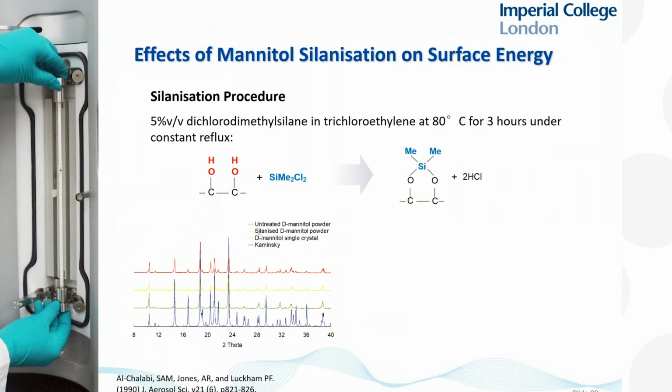Well, I said we also wanted to produce some hydrophobic material. So what we did was we took some silanizing chemical, and basically we went to some trouble to replace all the hydroxyl groups with methyl groups. So we're going to essentially make a hydrophobic material, no hydroxyl groups, so no polar forces, no acid-base forces, just van der Waals forces. And we treated that material. The X-ray diffraction is the same because we've just changed the surface chemistry. And XPS confirms the presence of our methyl groups on the surface.